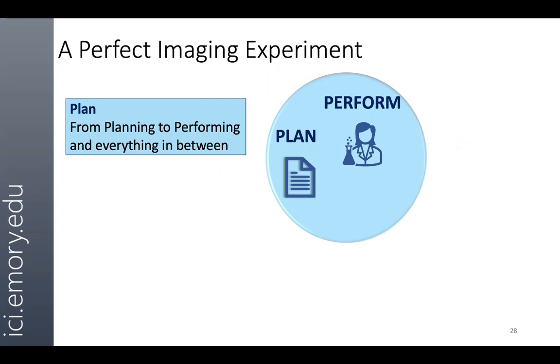So I mentioned earlier that it's great that we want to do bioimage analysis, but it is really limited based on the experiment that you are doing. Okay, so what is a perfect imaging experiment?